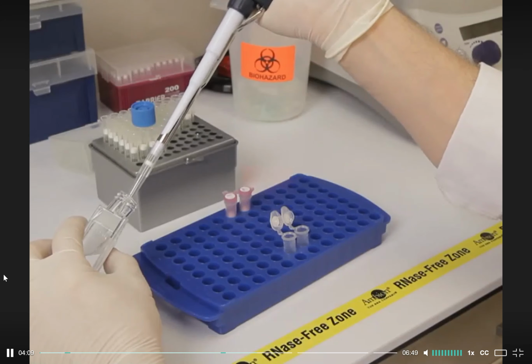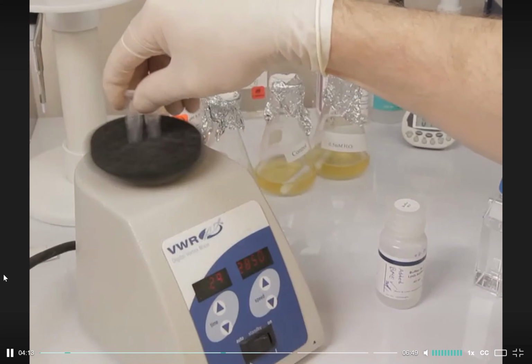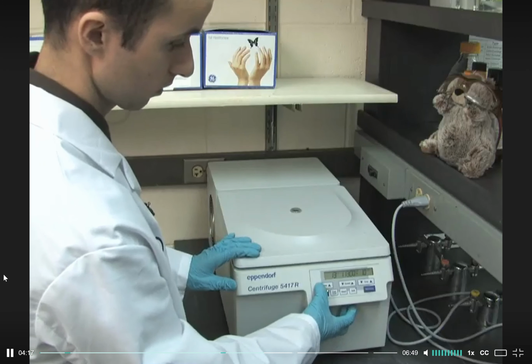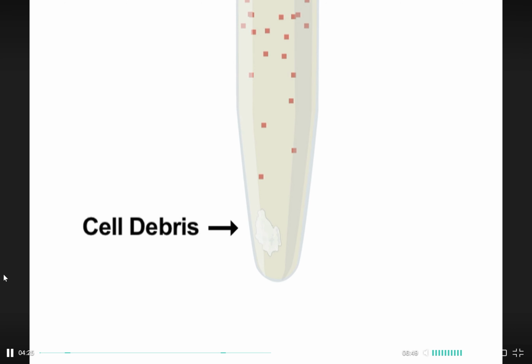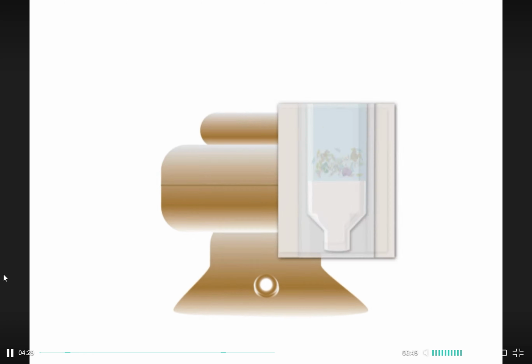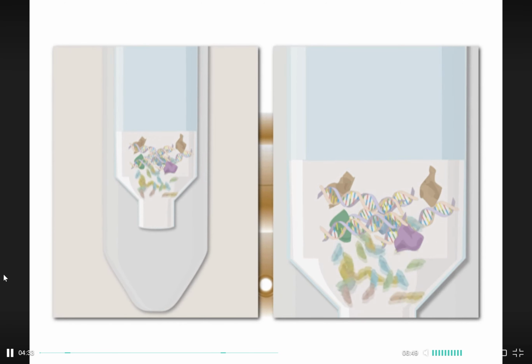After cell wall digestion, lysis buffer is added to the cells and the mixture is vortexed. The lysed cells should be centrifuged to clarify the mixture of debris, leaving DNA and small particulates and soluble proteins in the supernatant. The supernatant is loaded onto a silica column, and nucleic acids are then allowed to bind, following centrifugation, which will remove a bulk of the soluble impurities.